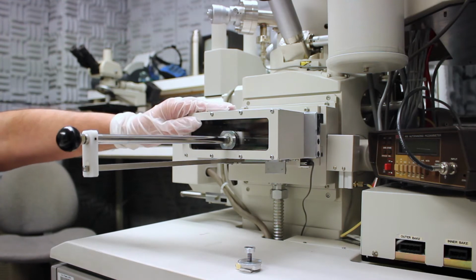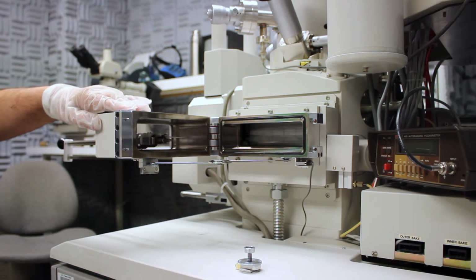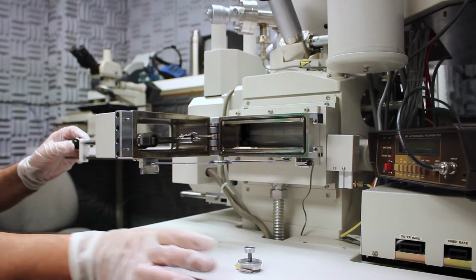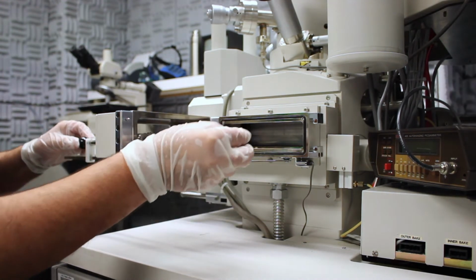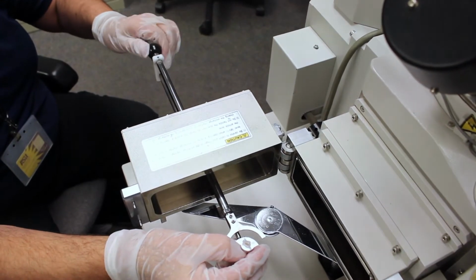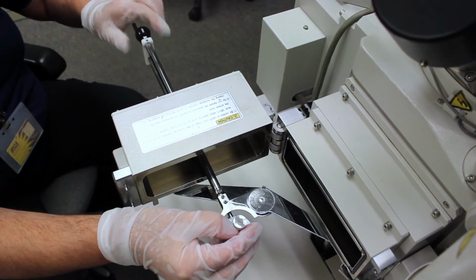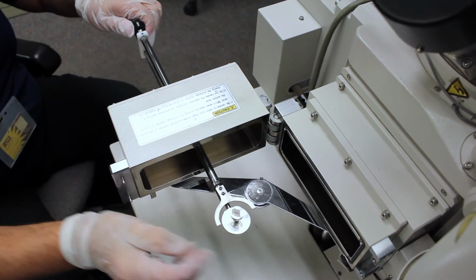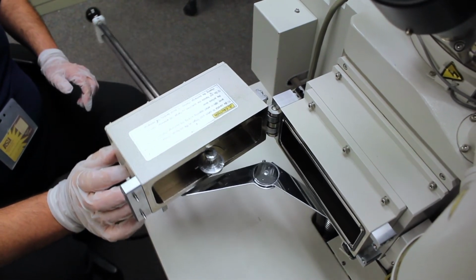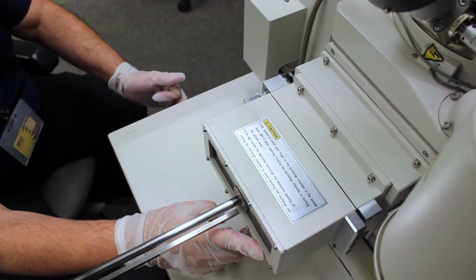Then grab the housing, not the rod. Bring it out until you hear the click. Unlock the rod. Grab the sample holder and feed the screw onto the holder. Right now there's about 20 turns, and you'll know when you hit the end stop. It won't turn anymore. There you go. So retract, lock the rod, again using your hand on the housing, not the rod, and then evacuate.